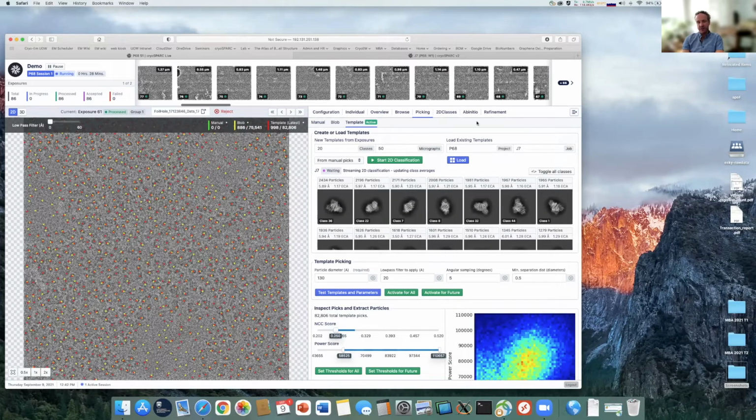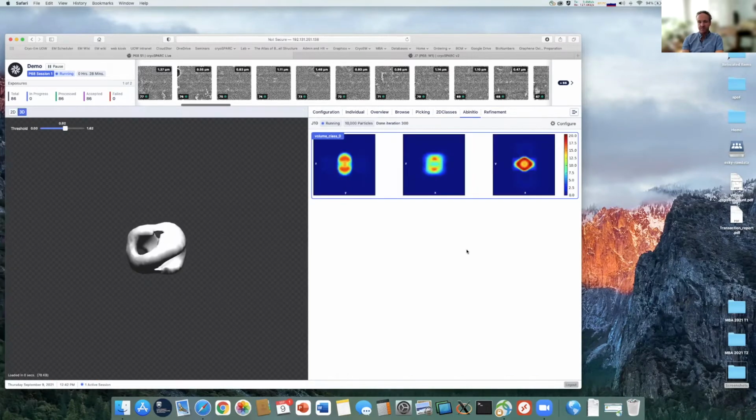Okay, so I'm not actually going to click on any now because I don't want to do a repick, because that might crash the ab initio job. This is about halfway done now. You can see it looks like a blob. Now, if anybody who's looked at ACCS before, it actually does have these 4 kind of lobes. So I know I'm heading in the right direction. And then we'll just let this finish.